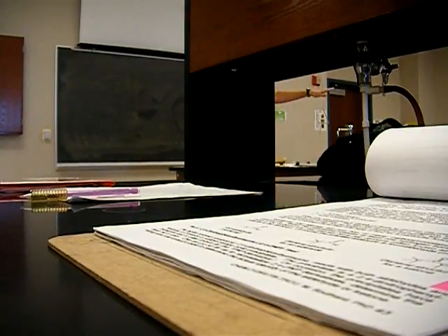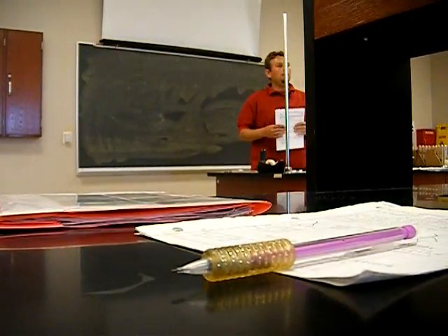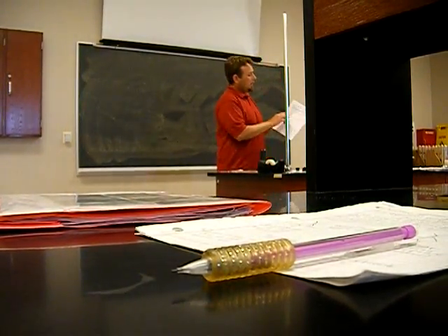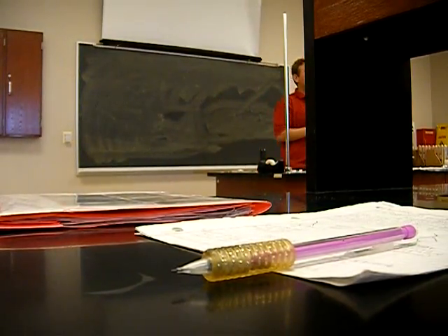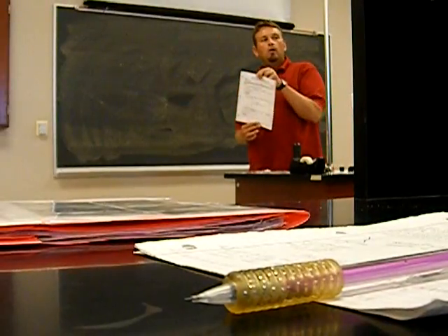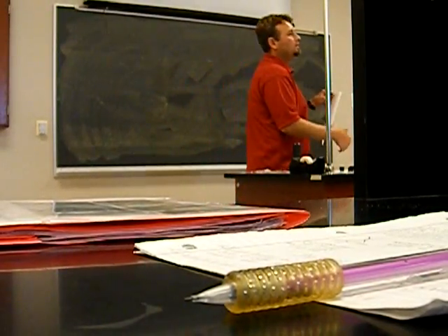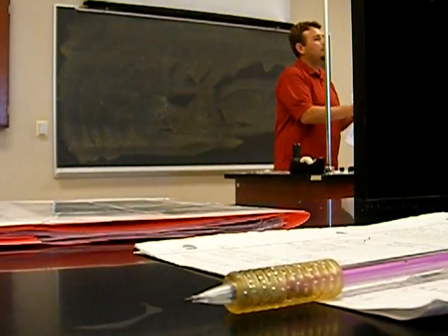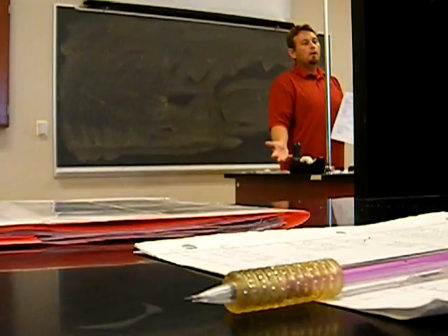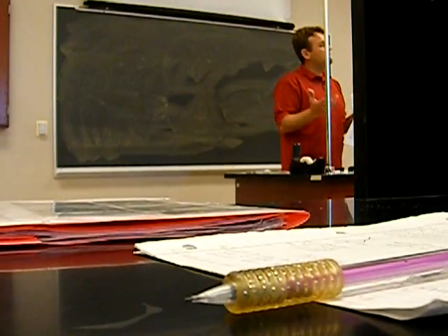All right. All the reagents are either in this hood, that hood, or this hood over here. These 3 hoods have all the reagents that you need. All right. And you'll see underneath the names of the reagents, you see where it says a little box that says positive or negative. Well, if there's a reaction, if there's some evidence of a chemical reaction, we say, okay, well that's a positive test. Was there a color change? Did a precipitate form? Did it warm up? Did gas evolve out of the reaction? Those are all signs of chemical changes.